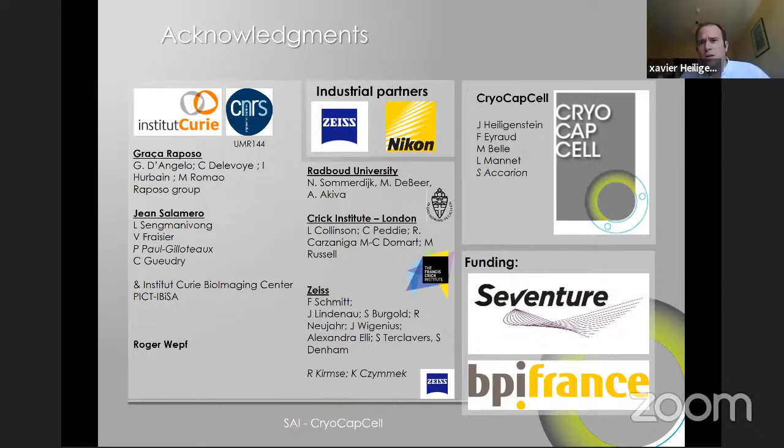So the European network is called the COST COMULIS, so C-O-S-T, C-O-M-U-L-I-S, and the COST COMULIS has as a point to bring together all the knowledge about correlative microscopies in a very large way and all the software and put that all at once into one website where you can find everything. So this European thing is already accessible.